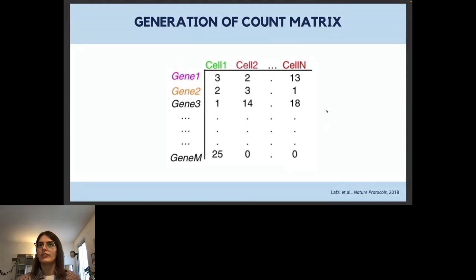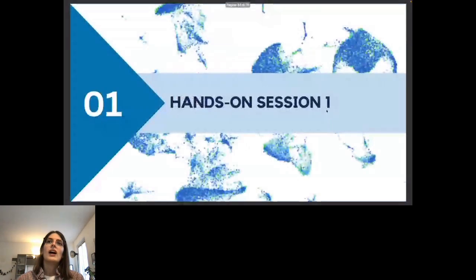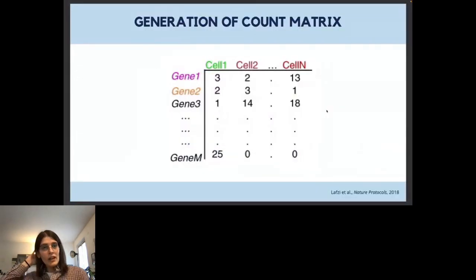So we have these very huge matrices. Up to here, I will stop now and give you a 5 minute break, just because I gave you a lot of information and I want you to digest everything. Then we will go into the hands-on part, so we will see a little bit of the analysis. And of course, if you have any question, you can write them in the Q&A box, and we will answer them after the break. So we will resume in 5 minutes.